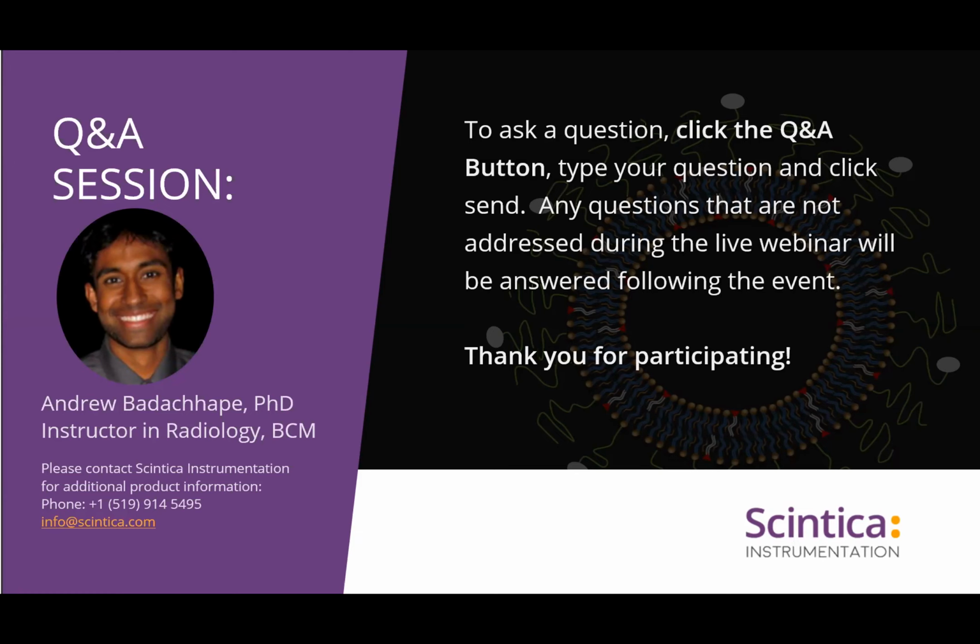Also, really quickly before I go into that, I've seen a lot of questions about the administration method for the contrast agent, which I completely forgot to mention. I'm very sorry. This is primarily applied through tail vein injection. So we'll typically set up a catheter through the tail vein, and we will inject for these contrast applications.